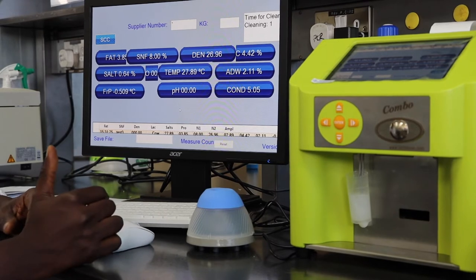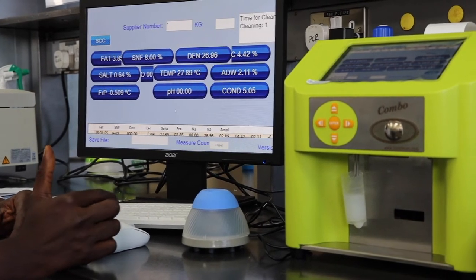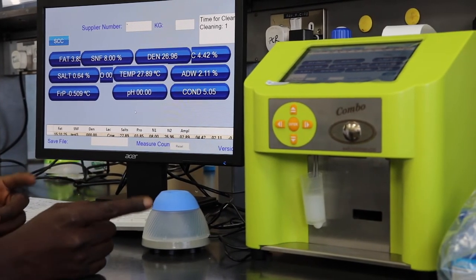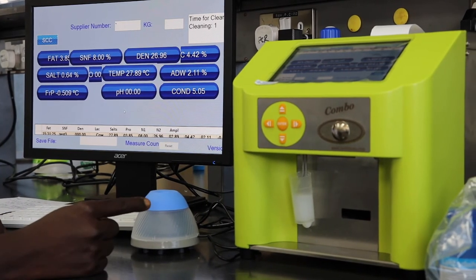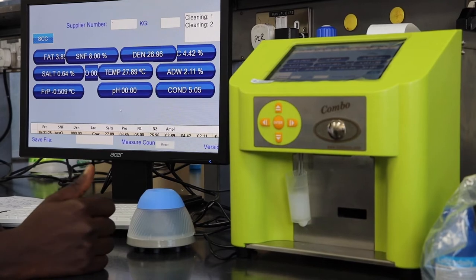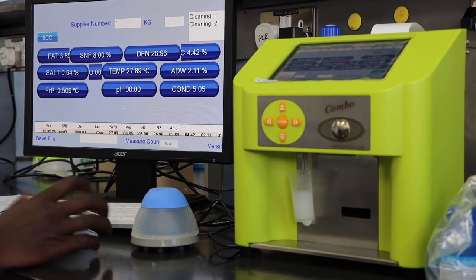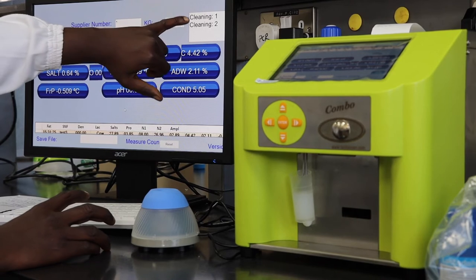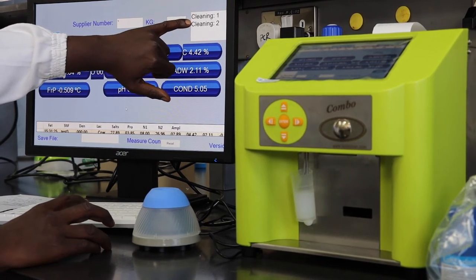Cleaning takes place using eight cycles. The solution is drawn eight times, goes through the instrument, and cleaning is performed. This takes quite some time, probably up to a minute. As cleaning is progressing, the cycles appear on the screen here.